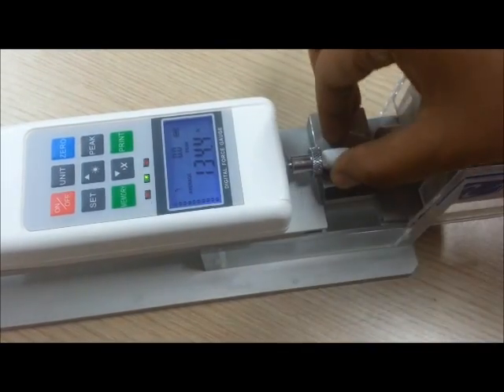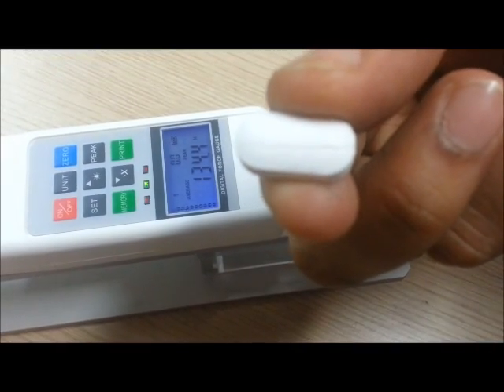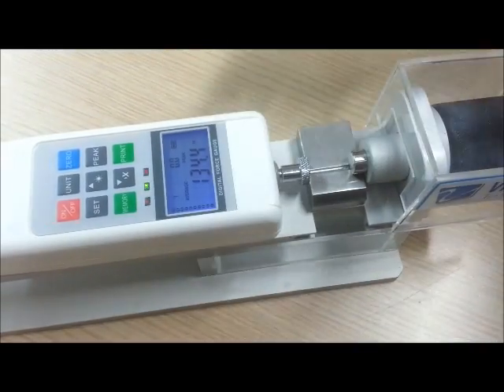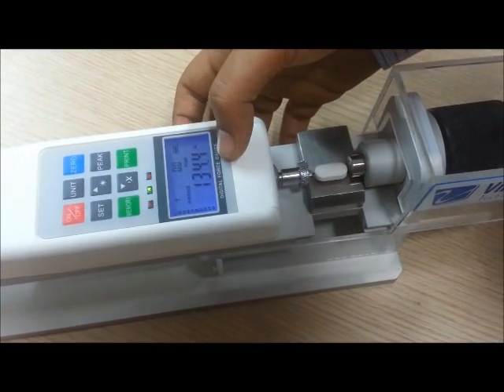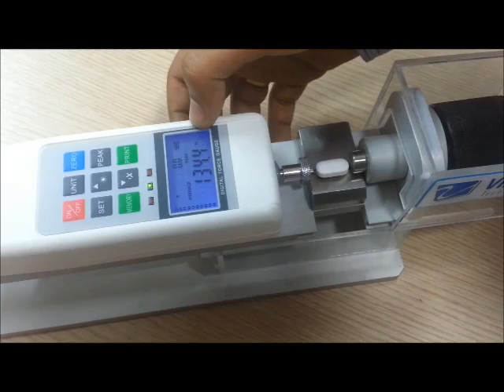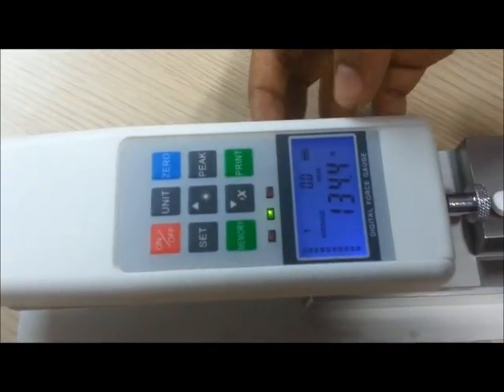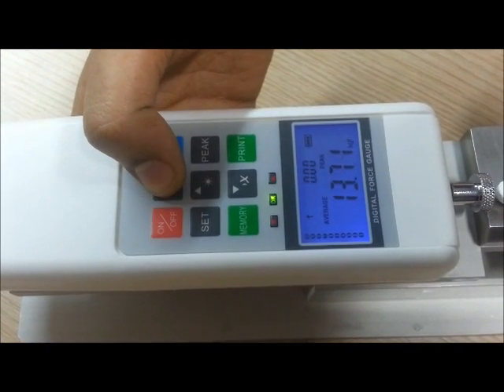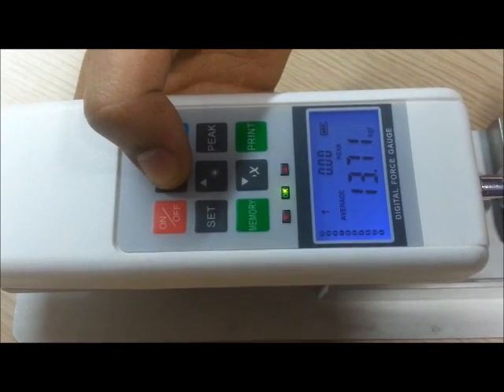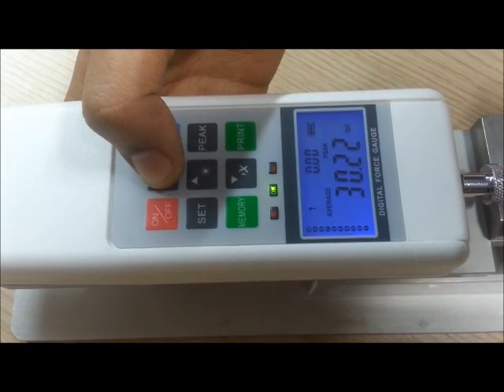Out here you can see the tablet has been fractured. The force which was applied was 134.4 Newtons. You can also see the reading in different parameters: in kgf at 13.71 and in lbf at 30.22.